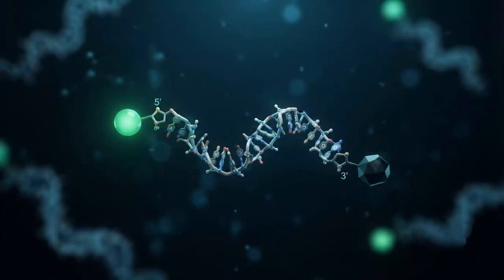At first glance, a TaqMan probe looks like an ordinary DNA oligonucleotide, but chemically, it's much more sophisticated. In addition to its DNA sequence, the probe carries two important modifications: a fluorescent reporter, attached to the 5' end, and a quencher, attached to the 3' end.